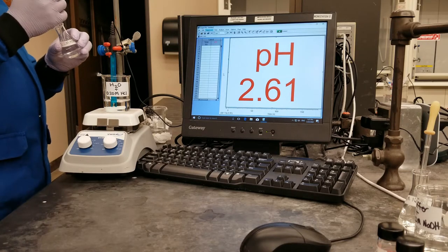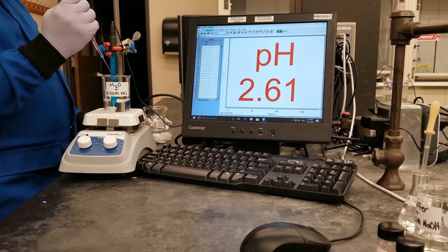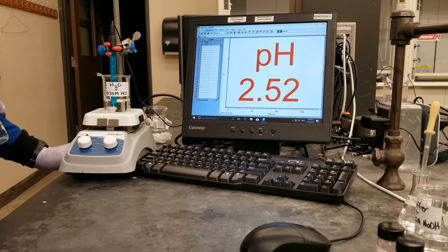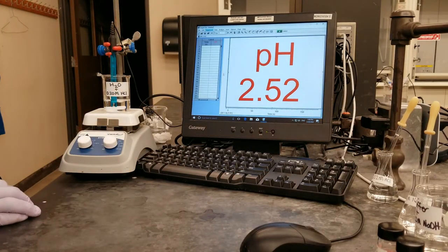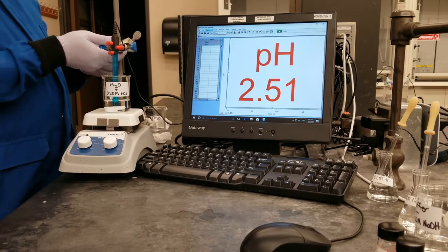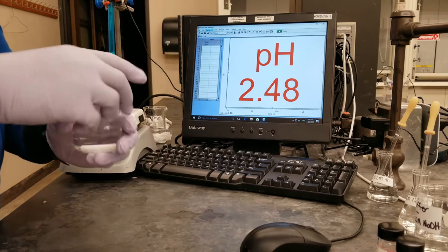I will go ahead to add the final 10 drops to the solution and wait for the pH probe to settle. And that takes the pH down to 2.52. We will now move to the next experiment, which is using water with the sodium hydroxide solution.